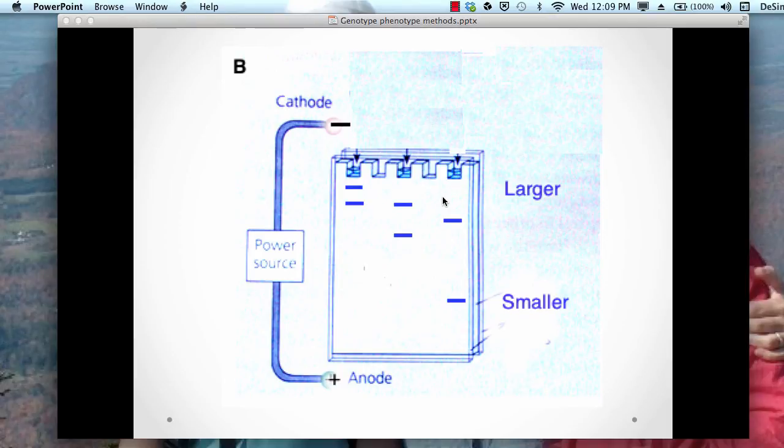Keep in mind that as a human, you will have two copies of the Tas2R38 gene in each cell. One you inherited from your mother and another from your father. So you'll have the potential to have either two PAVs, two AVIs, or one of each type of DNA in your PCR reaction. And there you have it, how to use RFLP to determine your Tas2R38 genotype.